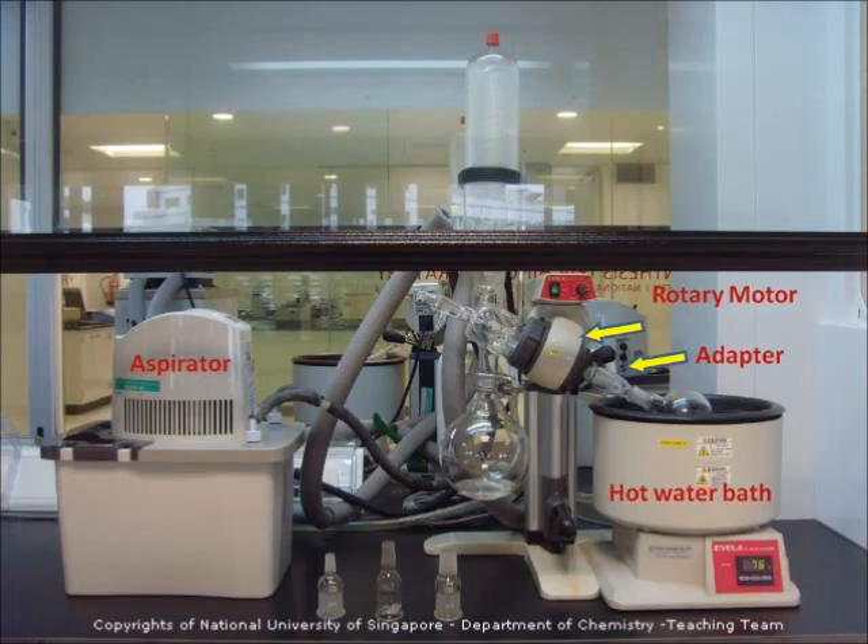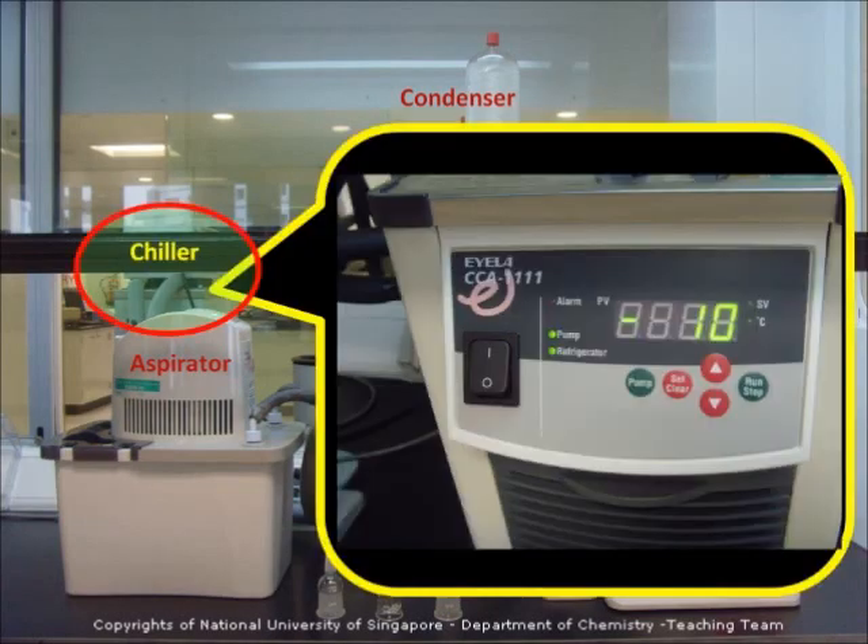An aspirator to create vacuum by suction. A cool condenser to condense the vapor solvent from the flask, and a receiver to collect the condensed solvent. The chiller maintains the temperature in the condenser.